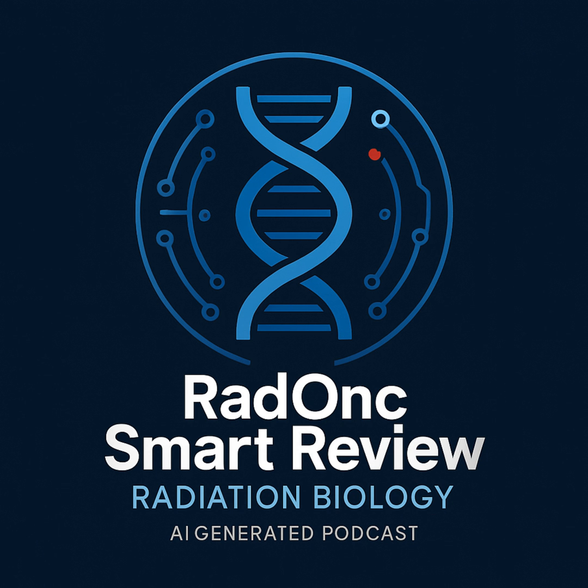You take the number of cells you seeded on that specific irradiated dish and multiply it by the plating efficiency, but use the PE as a decimal. So if PE was 70%, you multiply by 0.7. Okay, so expected colonies equals cells seeded on irradiated dish multiplied by PE as a decimal. Got it. That gives you the number of colonies you'd predict just based on the plating conditions alone.